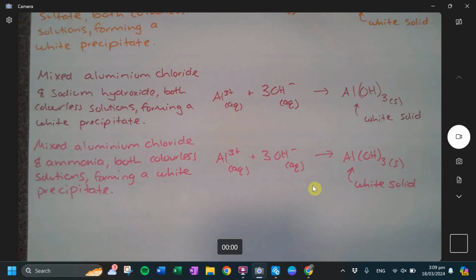All right, rinse out the yellow container. You can stack the black container onto the yellow container, and then you can put the beaker and the distilled water bottle into the black beaker, so that collates some of the space. And then we'll just place the black and the blue ice cream cans at the back of the classroom so we can reuse it. Okay? Now I'll pass out the homework.